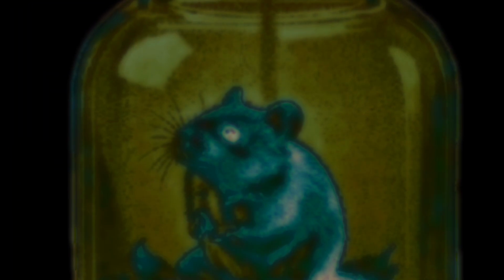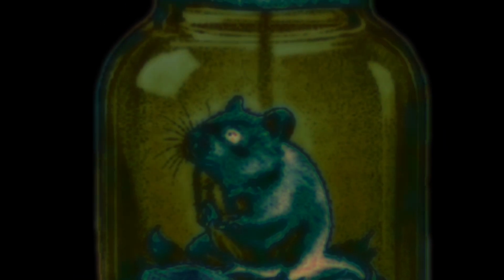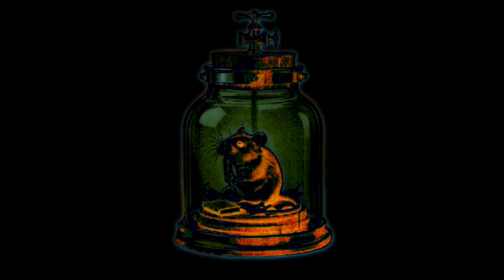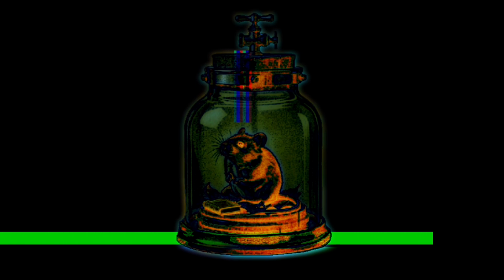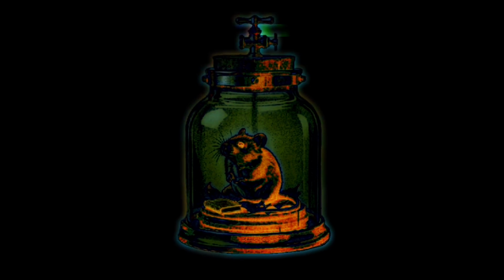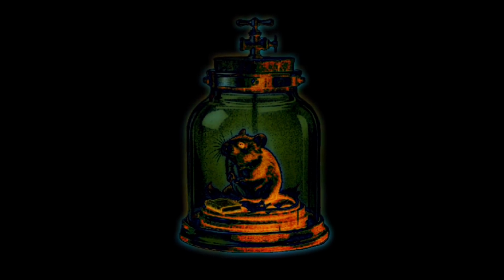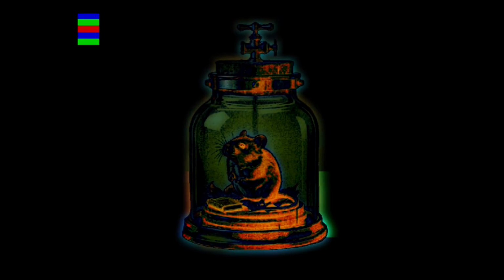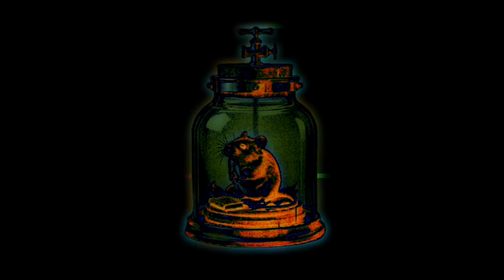I want to say the condenser I was using was a 500mm air condenser, although it was cold outside, there was a risk of formaldehyde escaping through the pump. I can't give you a yield, but as this was a demonstration, I can confirm that this was a successful prep. It ends with me slowly evaporating a solution containing a significant amount of ammonium chloride, but some methylammonium chloride crystallized afterwards as a distinctly different fraction. It was hygroscopic and it had turned into a mush by the next day.